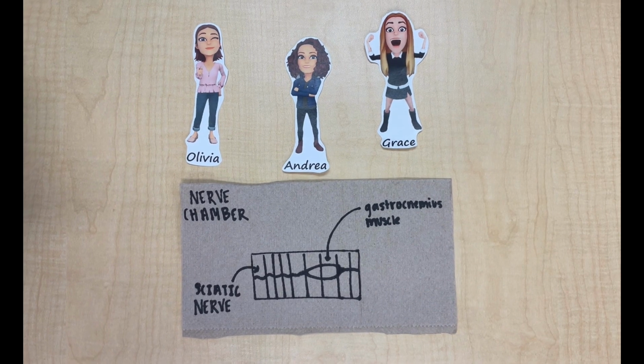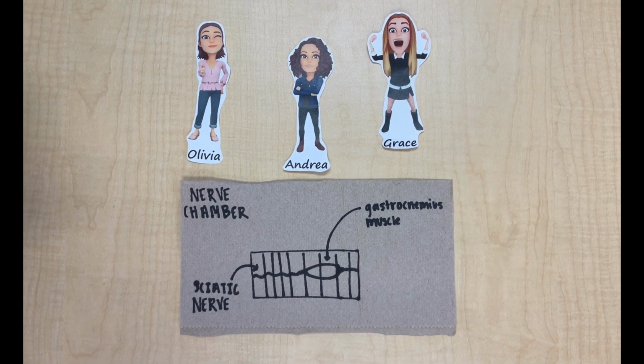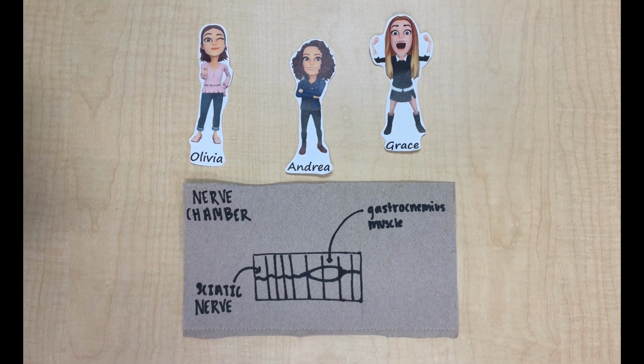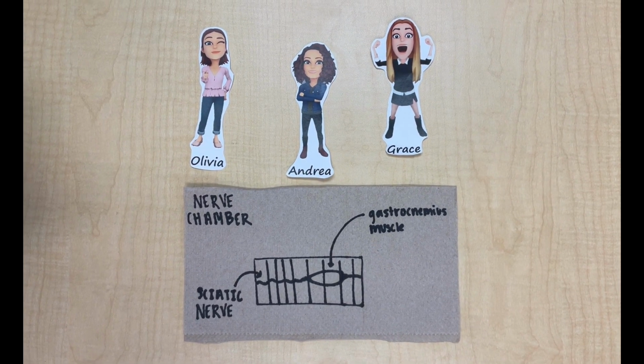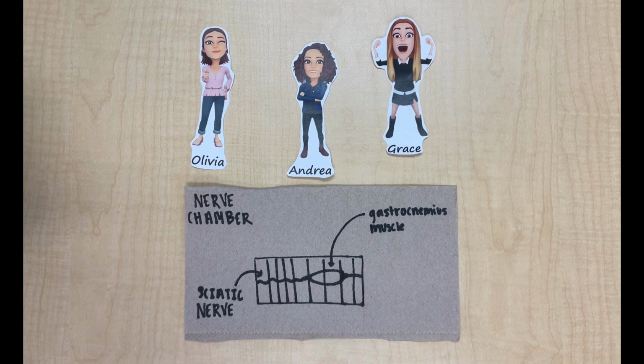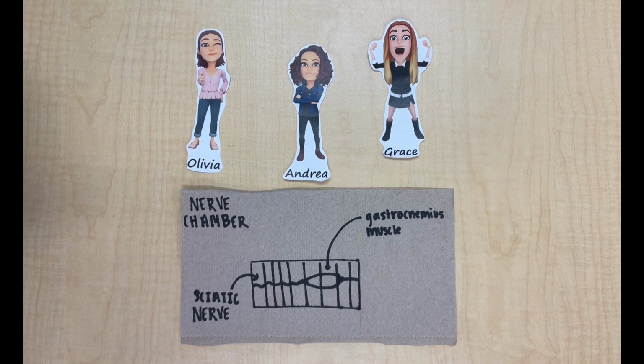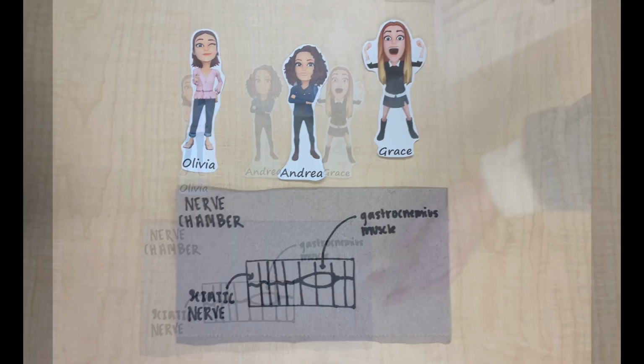We began by dissecting out the sciatic nerve and gastrocnemius muscle from a frog, placed them in the nerve chamber accordingly, and used stimulating and recording electrodes. The solutions were added only to the muscle, and before each different solution, the whole chamber was filled with plain ringers and a control was taken.